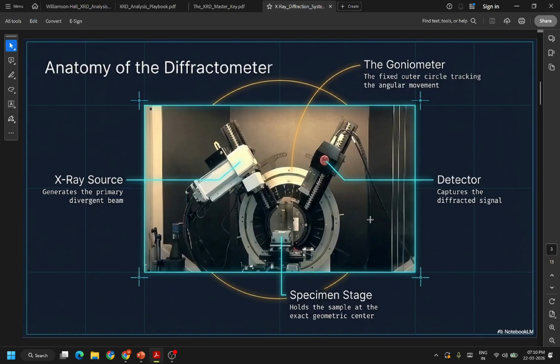So it's grazing incidence because it's almost 0 degrees incidence. So you're measuring your XRD at like 0 to 5 degrees, or 0 to 1 degree, 0 to 2 degree angle. That is called GIXRD, grazing incidence XRD.